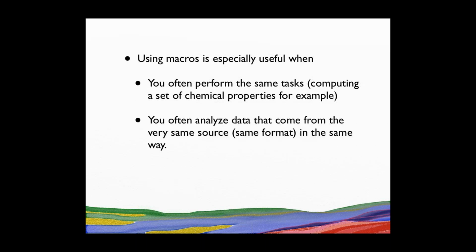Or you often analyze data that comes from the very same source. That's what happens at Idorsia. Our chemists want to see the results of our results database. So they have a complicated macro which they use every morning, and they fetch all this data and analyze it. It lasts maybe 5 minutes, and then they have their analysis done when they come back from having a coffee, for example.